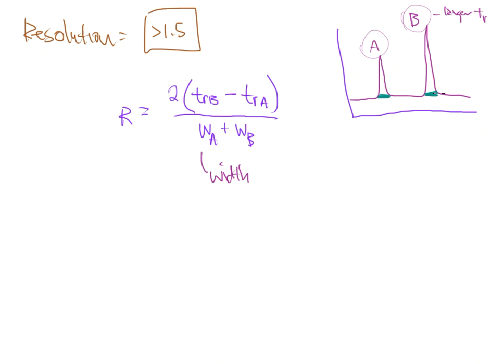And the same thing happens with B. And what they do is that they will measure these in form of time, not actual centimeters or millimeters. The widths are going to be measured in form of seconds or minutes most of the time. It really depends on the reporting, and it depends on the chromatogram itself. So seconds or minutes will be the width.